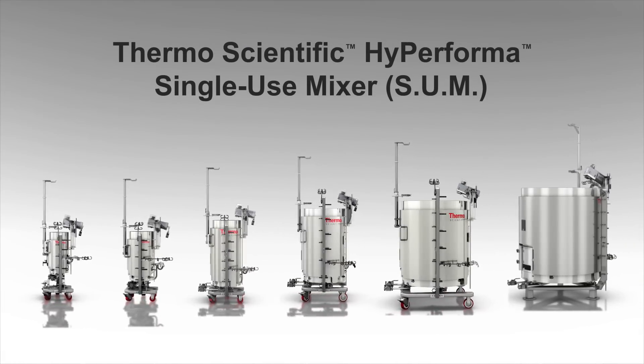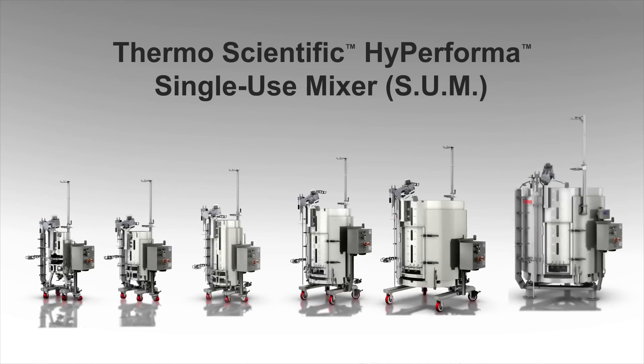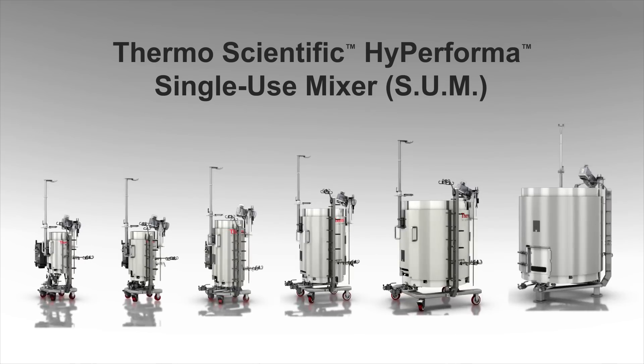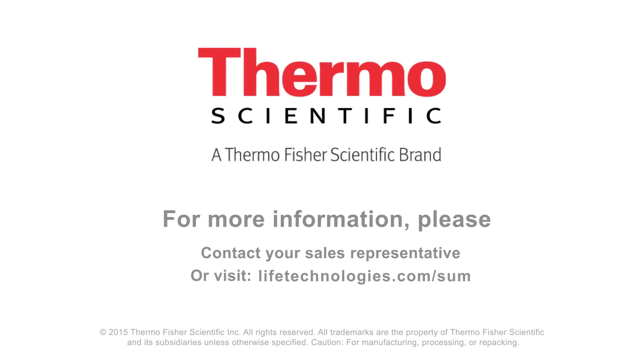The next-generation Thermo Scientific Hyperforma single-use mixer: a design-proven, user-friendly, and scalable solution for your critical upstream and downstream mixing applications. For more information, please contact your sales representative or visit lifetechnologies.com/SUM.